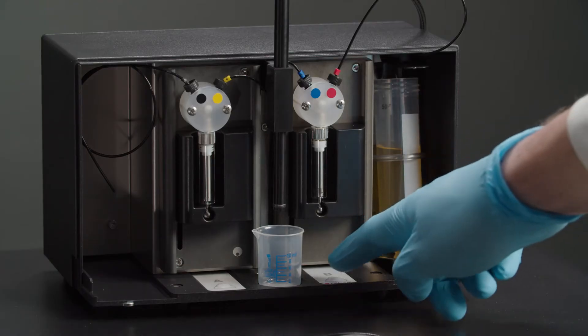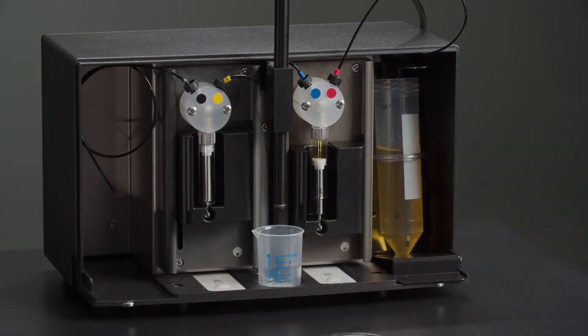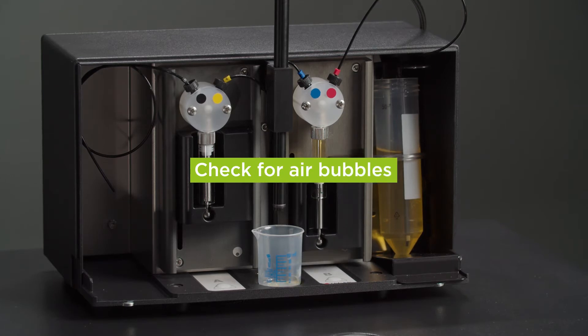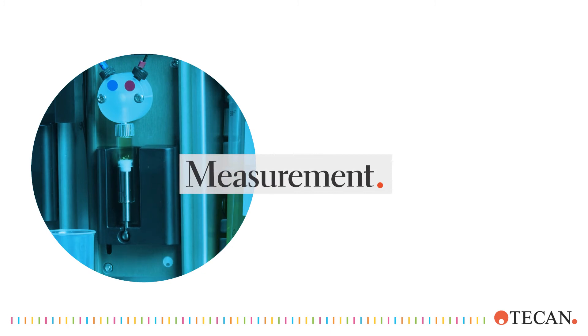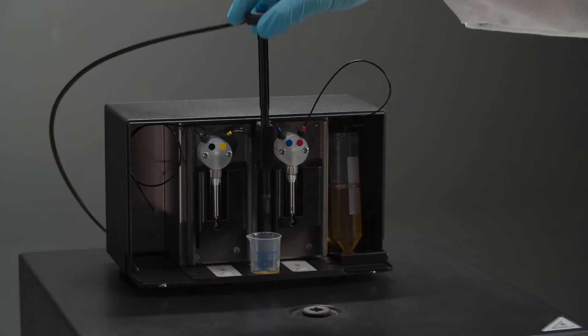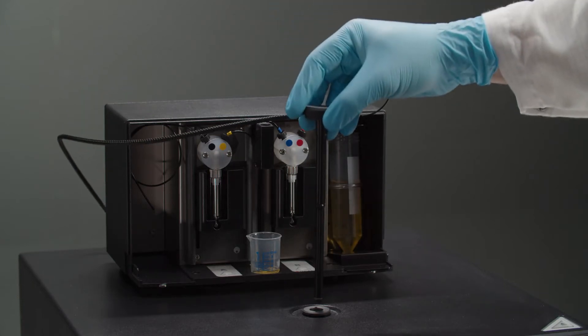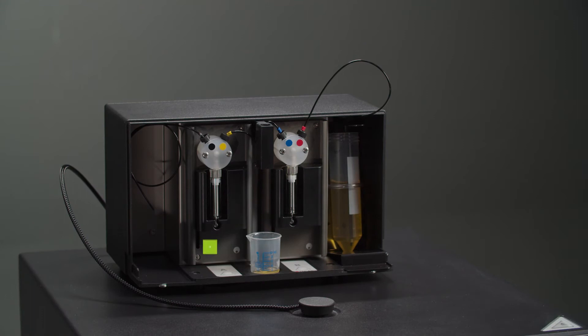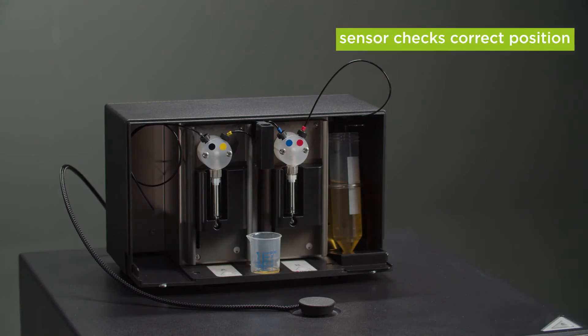You can also use the buttons on the module to prime the injector. Remove the plug if you haven't already and insert the injector carrier into the injector port. Press the carrier gently into the port to lock it in place. The instrument is equipped with a sensor that displays an error message when the injector carrier is not in the correct working position.